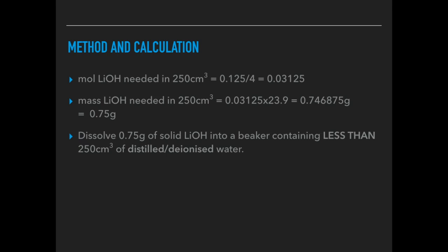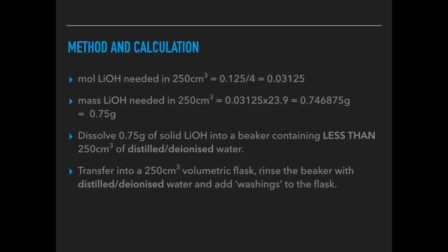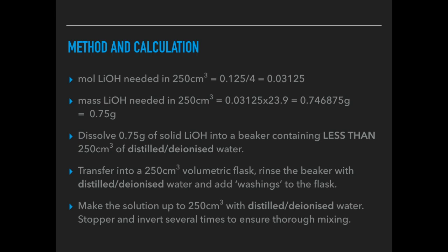Once I've weighed out the lithium hydroxide I would need to dissolve it into a beaker containing less than 250 cm³ of distilled or deionized water. I would normally get students to dissolve it in about 100 cm³. Once you've dissolved it you then transfer into a 250 cm³ volumetric flask, and then you should rinse the beaker again with distilled or deionized water and add what we call the washings to the flask. We're making sure that all of that lithium hydroxide goes into the volumetric flask. Then the final thing we do is make the solution up to 250 cm³ again with distilled or deionized water. Stopper and invert the flask several times to make sure everything is thoroughly mixed together.